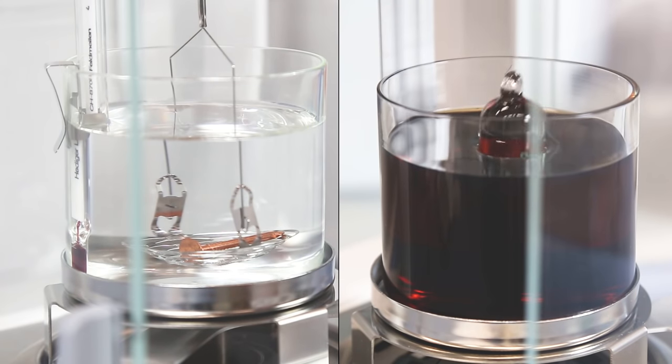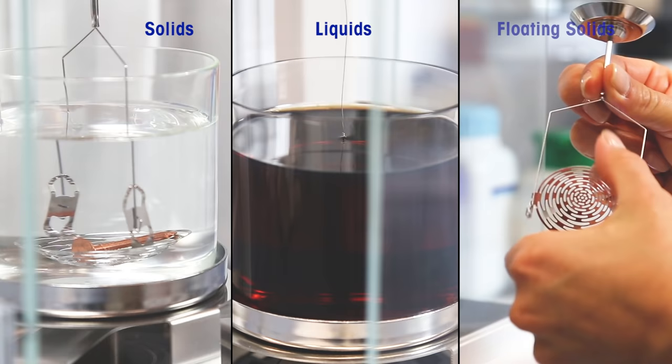By using a glass sinker of known volume, you can also determine the density of liquid samples.